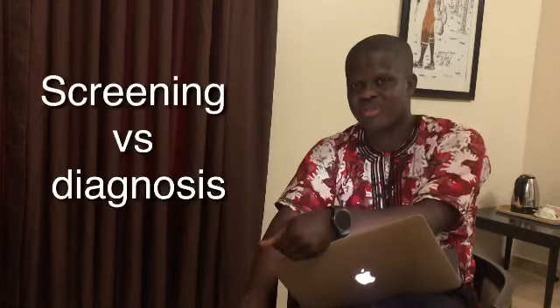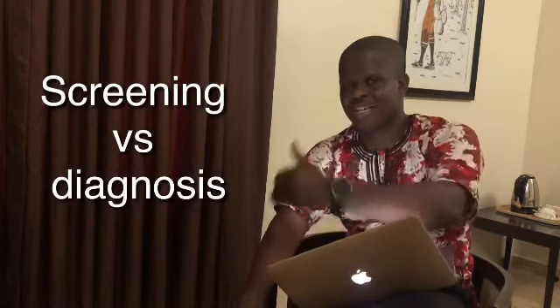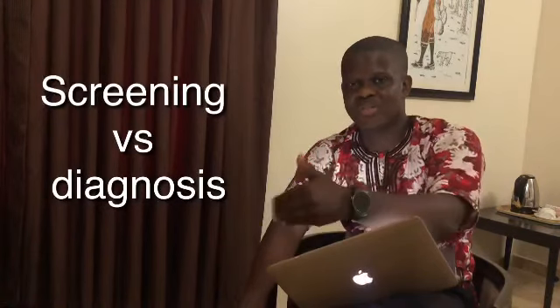In cytology, we may not be able to say where these malignant cells are located. But it will tell us that they are malignant cells, because of the fluid we are working with. So we now need a biopsy. So we can say that cytology serves a screening purpose in an ideal setting. What happens in our clinics are not the ideal settings, but I'm telling you what the ideal setting is.